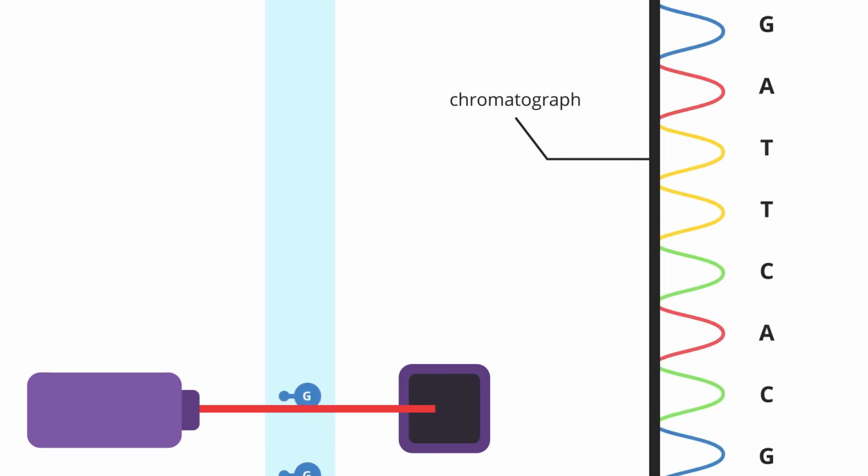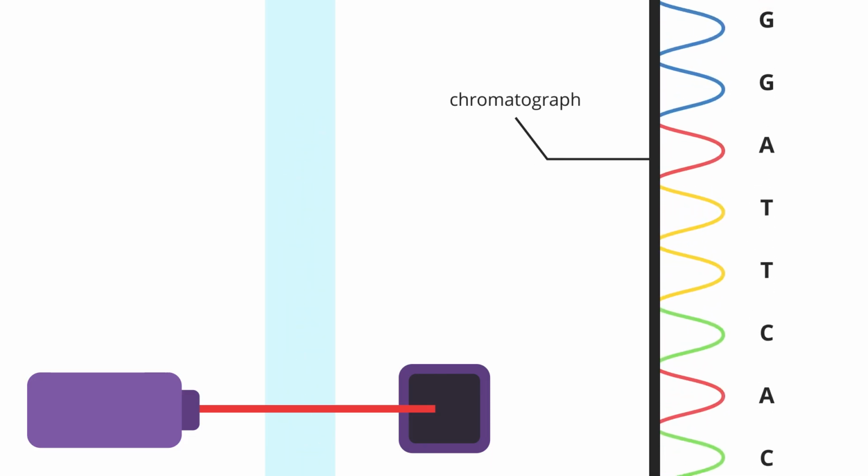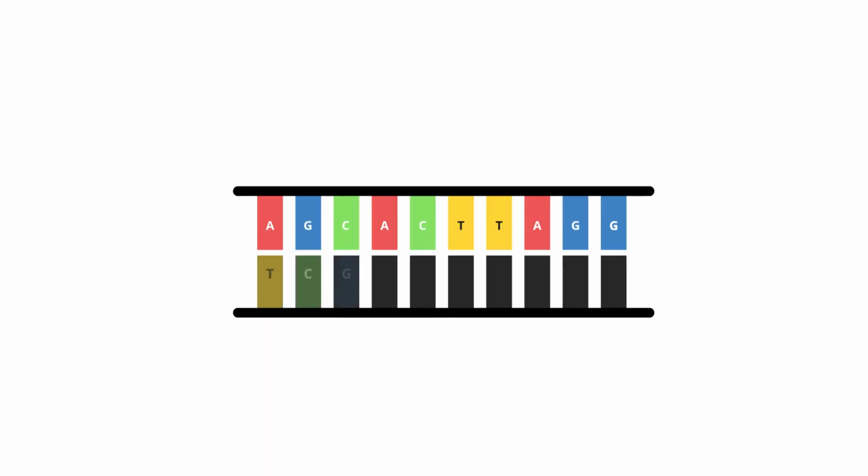Now we know the length of the strand and the base which was incorporated last, so we can determine our DNA sequence. This new method of using fluorescent dideoxynucleotides made everything a lot faster and cheaper, also considering that you didn't have to make separate reaction mixtures and could just throw everything into the same mixture.